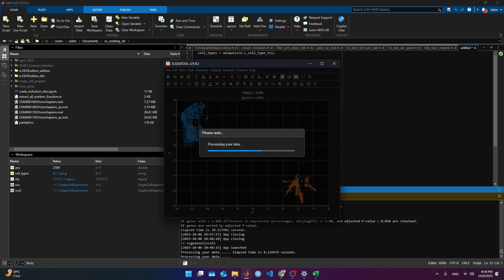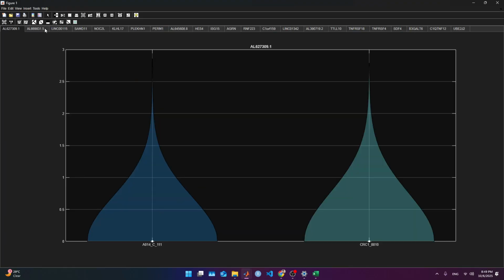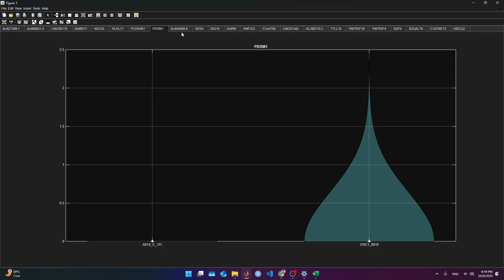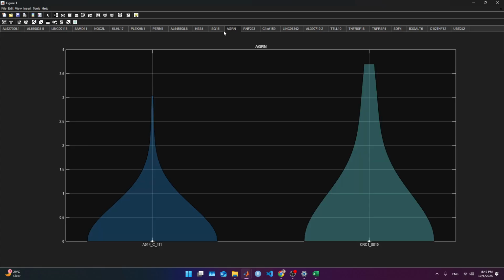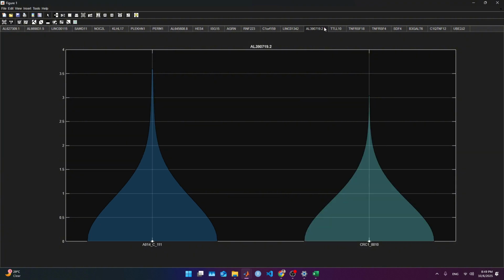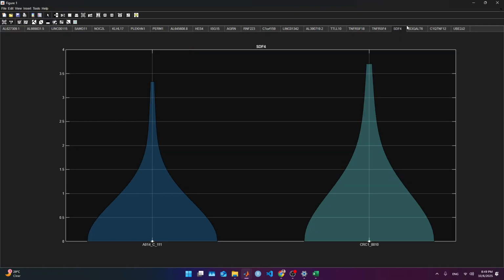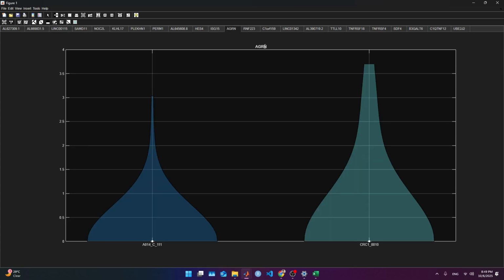I'm going to stop it and come back. And I'll get it here. This is what we get. It doesn't look as differential as we might want. So let's look for, that looks fine. That's good, but I'm not going to use that because I need something with some shape. AGRN looks like a good candidate. AGRN. See, and now we have different upregulation and downregulation in some of the genes. That's cool. That's exactly the purpose. So we are going to use AGRN.